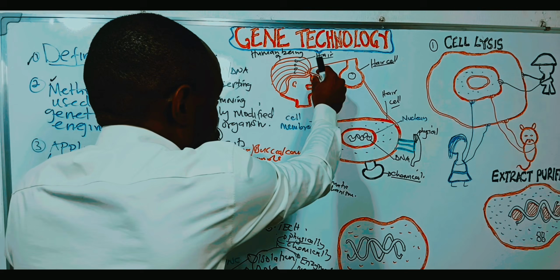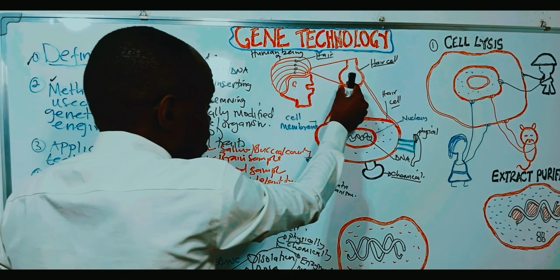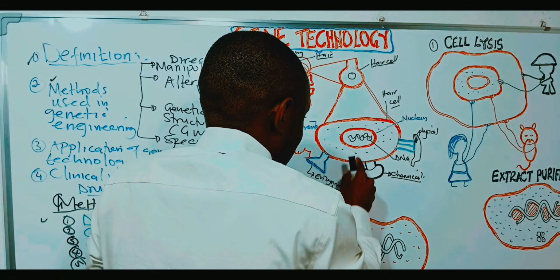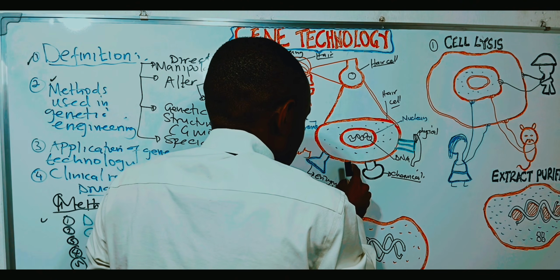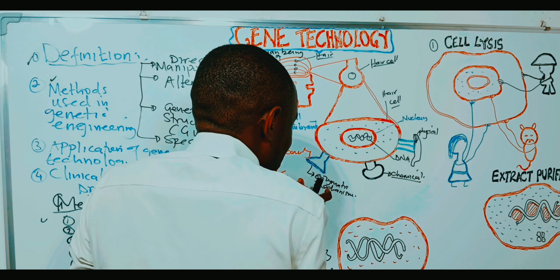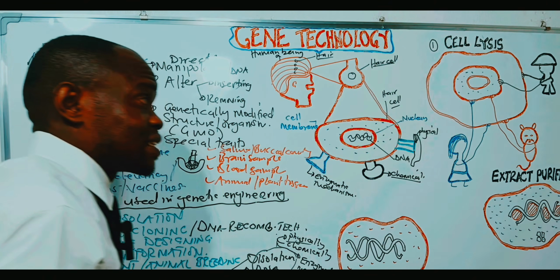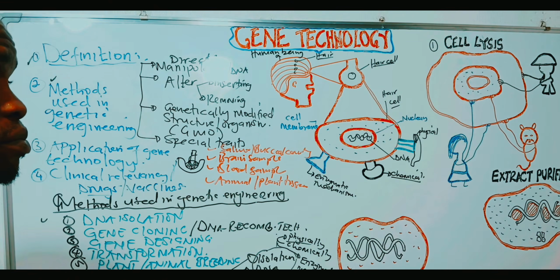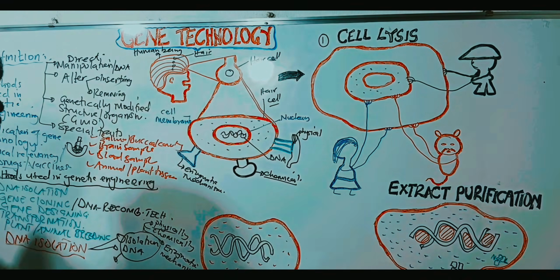A human being extracted one cell. This one cell is what we are seeing here. We have magnified it. This is the one cell, containing the DNA, the nucleus, the cell membrane, and here are different ways we are trying to break what? Break something called what? The cell. You get?